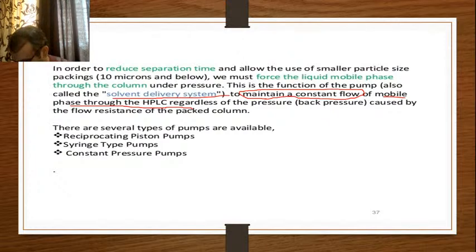And that's why three types of pumps are there for the HPLC: reciprocating piston pumps, syringe type pumps, and constant pressure pumps.